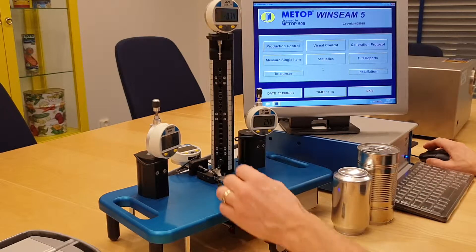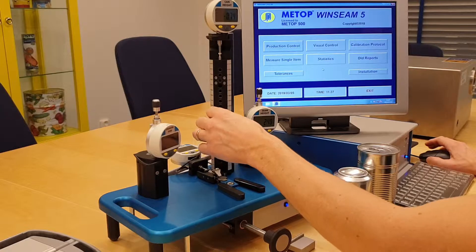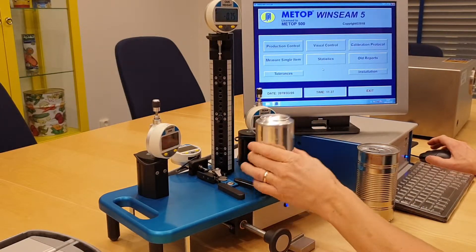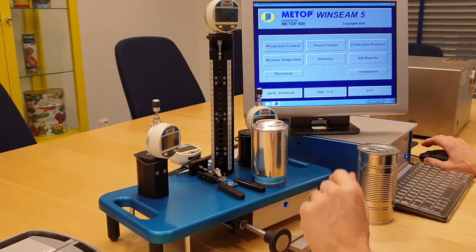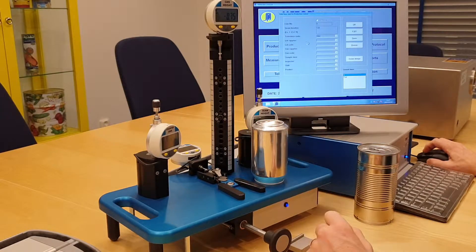Then to start a measurement, you simply put the can height pin in the height that you know the can is. Today I'm going to test a 330 milliliter beverage can. You start a production.